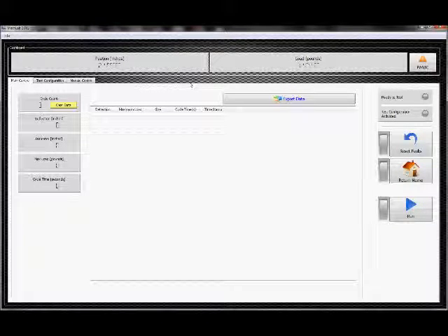This is the main control screen. Most of our work happens here. I'm going to take you from left to right. This is the dashboard. We have the position display, that's live. We have the live load display.